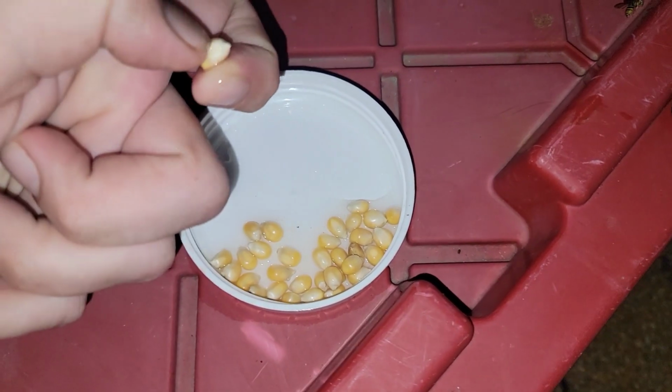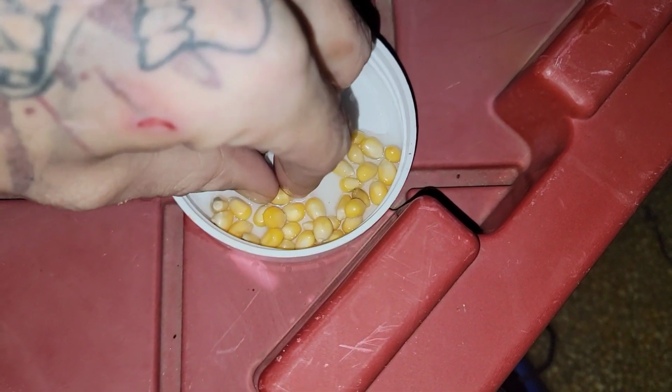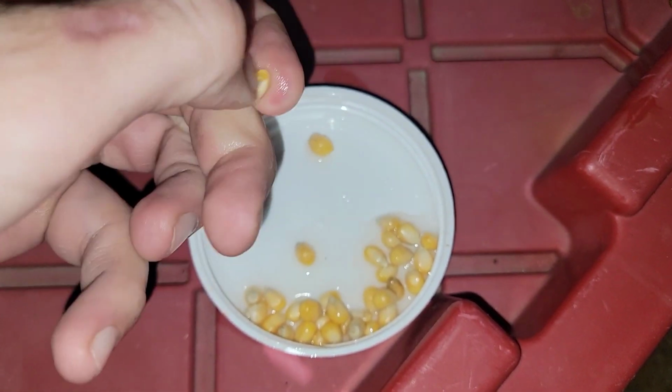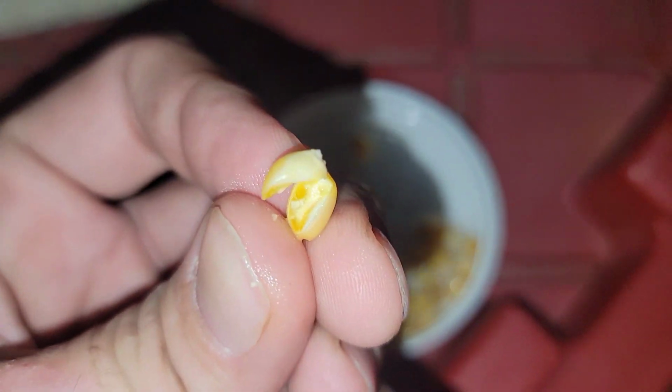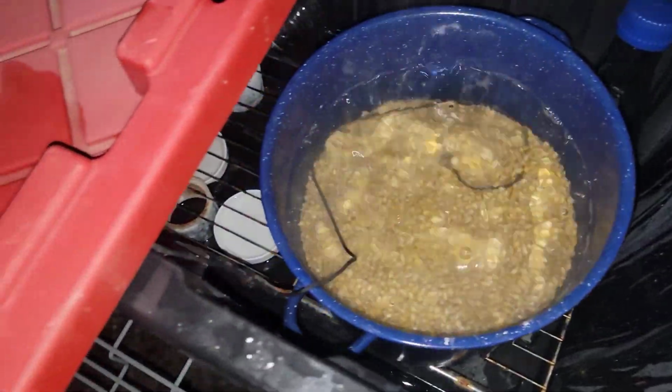Let's grab another one. Damn it. Come on now. I need stronger thumbnails. There we go. Perfectly split, barely any white. Time to drain that and get our substrate in.